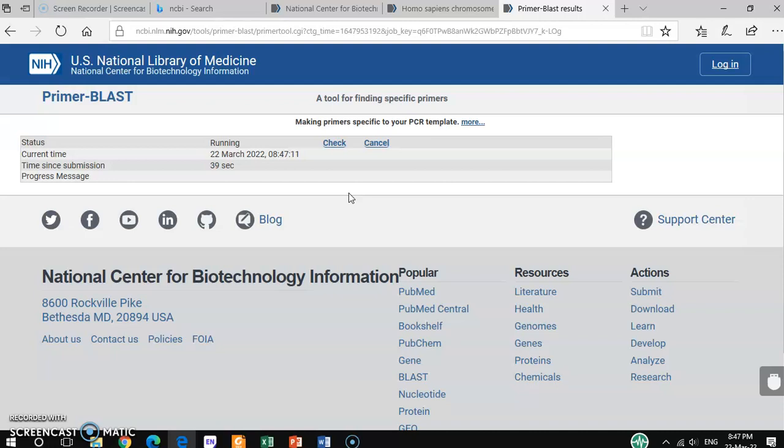There are also some other online tools where you can get very accurate primers. I remember I also showed how to get primers using GenScript. You can go through those online tools too, and get very accurate and perfect primers, because in some cases the primers that we design manually are not perfect, and then there are chances of error in the amplicon size and the amplification.